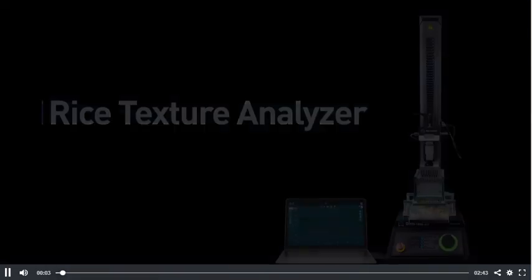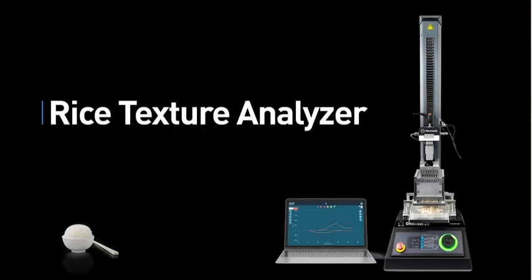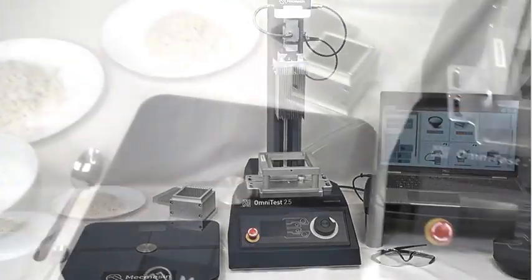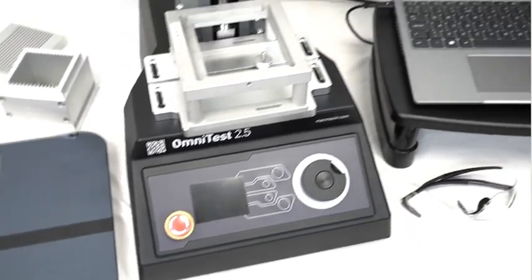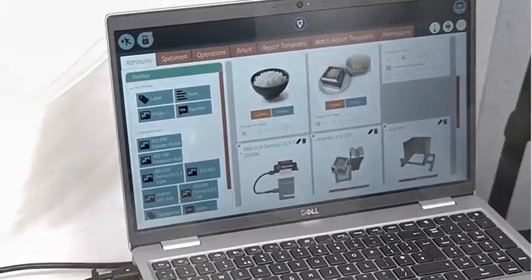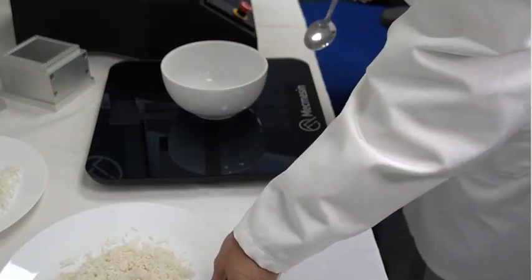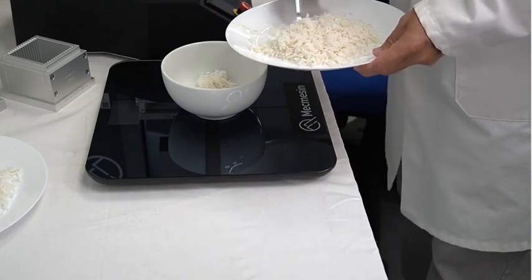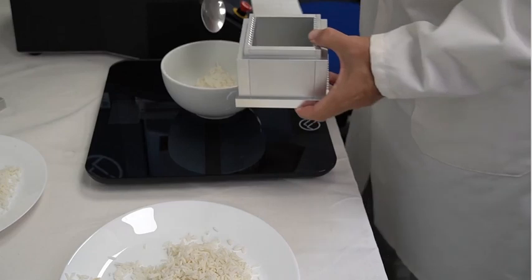Rice Texture Analyzer is a benchtop software-controlled system to evaluate the physical sensory properties of rice. The results define the texture profile attributes that correlate to mouthfeel, influencing perceived quality. Rice producers use texture analysis to understand the way cooking and preparation, grain type, and harvesting conditions align with consumer acceptance.